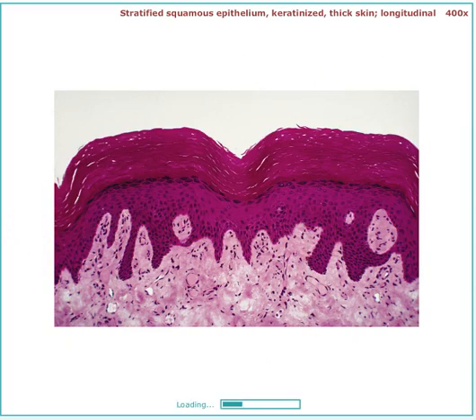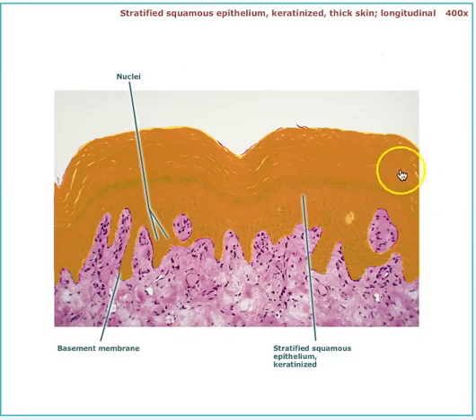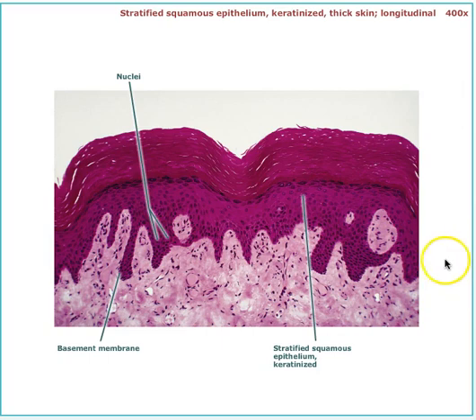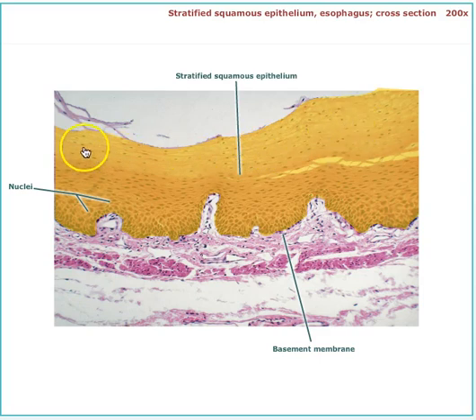So let's go back and we're going to look. You'll notice there's an absence of a keratinized layer. See up here? You don't see the purple waves. And then we go here and you see these purple waves, these anucleated purple waves. So you'll look here in this layer, you see that there are these dark purple dots. That's the nuclei, okay? So if you look up here, it's definitely not the same thing. Up here, there's no nucleus, so this is not cells, we're looking at protein. So one more time, we'll go backwards. Look at all of the purple dots. Those are nuclei. So these are cells. This is alive, quote unquote.